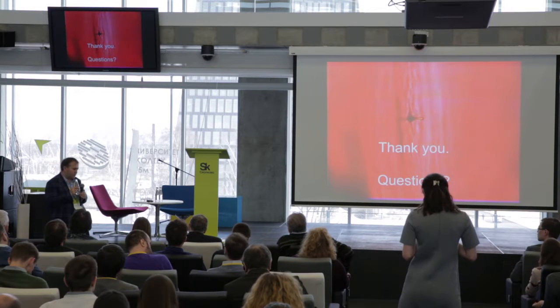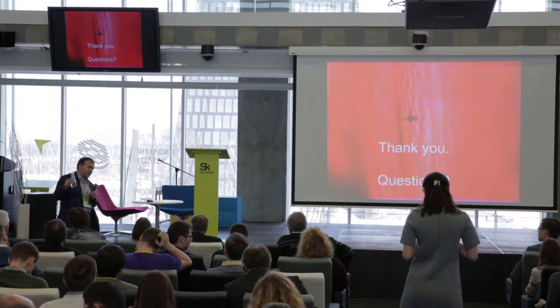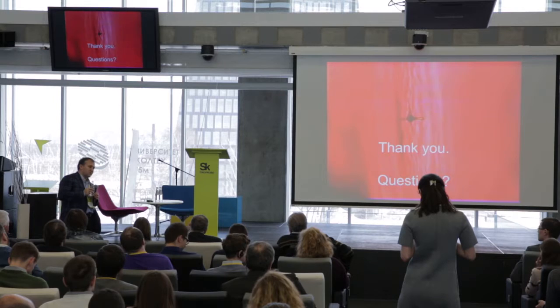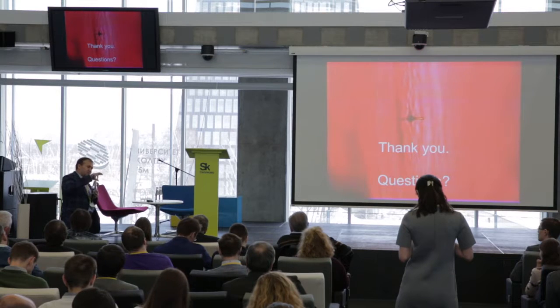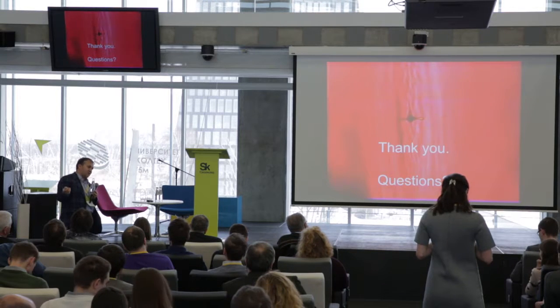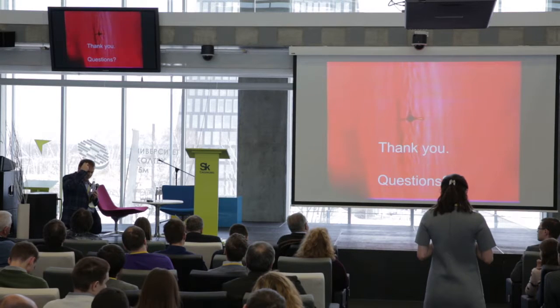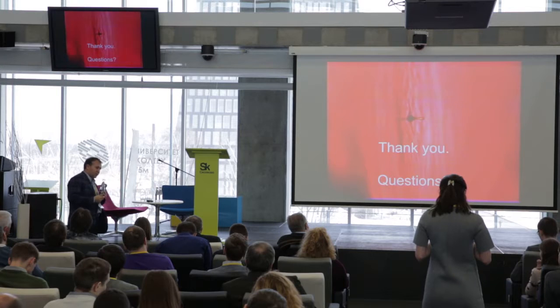Yes, we have been working with human iPS cells that are differentiated into cardiac cells. That's what we have been recently doing, to relate the geometry to mechanical function. We have also been working with human iPS cells differentiated into hepatocytes with some of my collaborators at Stanford, to implant them into animals and look at function.